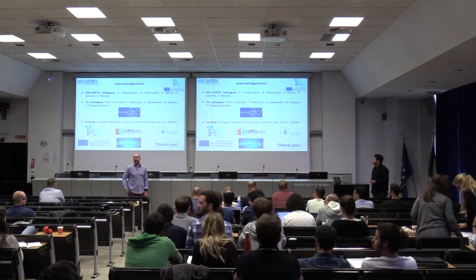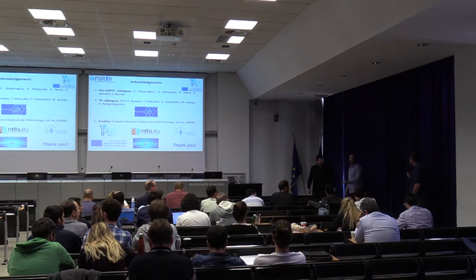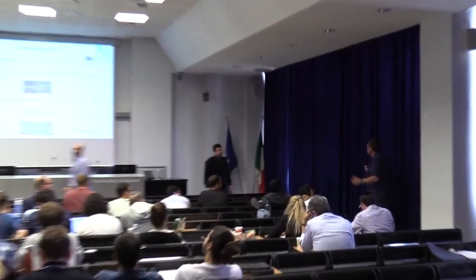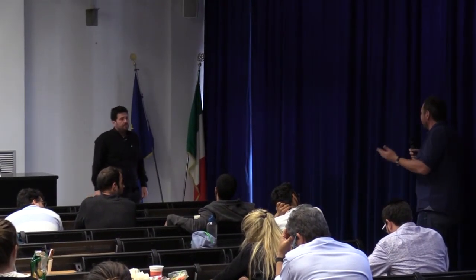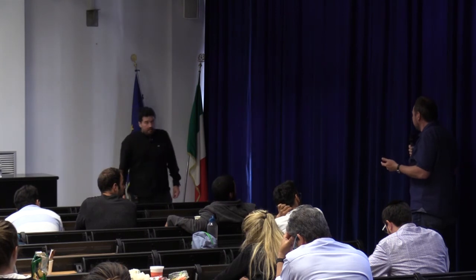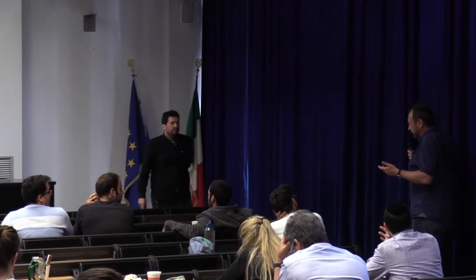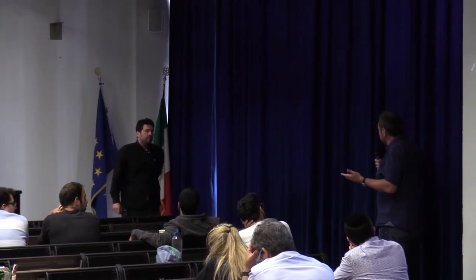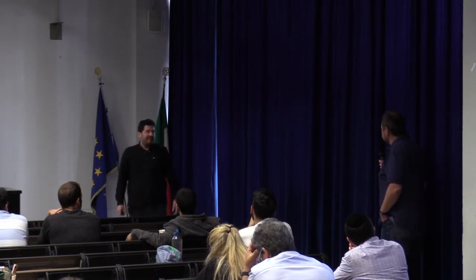Any questions? Yes. You showed 2 models for the interpretation of the decay curves, and when you presented your results, you showed the 3 exponential. This is always a question which model to use and how to interpret the components. Would it be appropriate to show an average decay time in this case, or what's your view? People don't like this. I don't know.